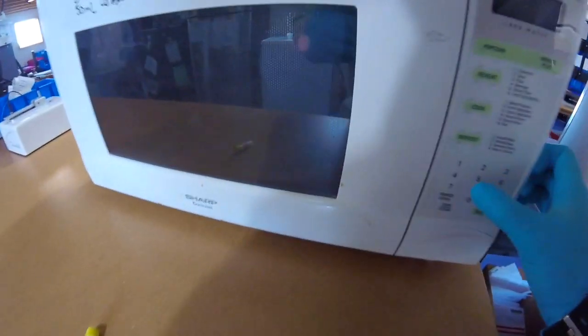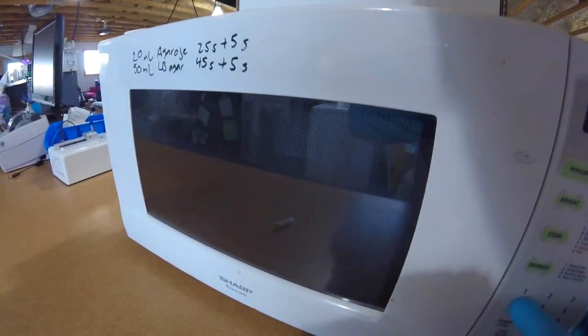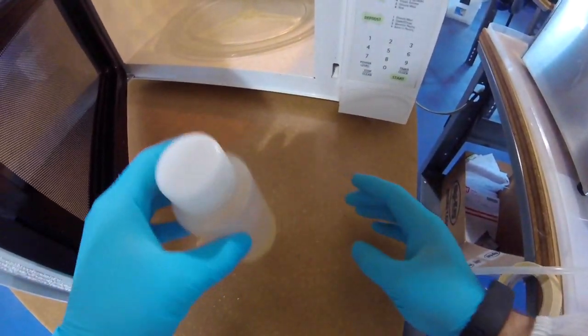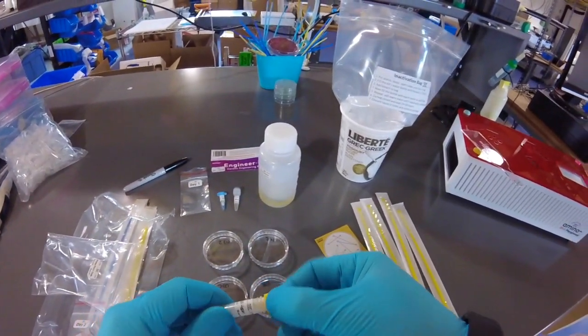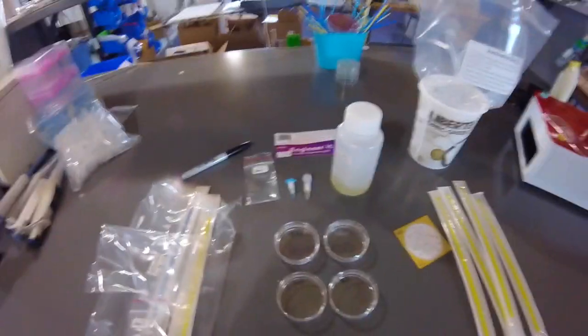So I'm going to do that. 5 seconds. Okay, there was no foaming. I'm going to do another 4 seconds. There we go. You see that foaming? Now it's going down. Okay, so now we're perfect. This is going to work out perfectly. So now we're going to go back to here. When you discard your tubes, you just take the lid off and put it into your baggie, okay?